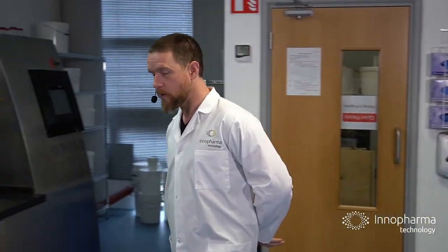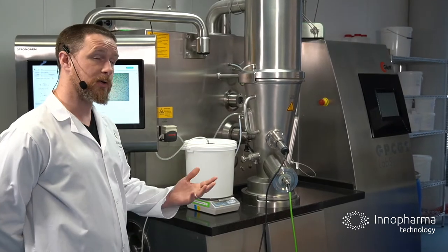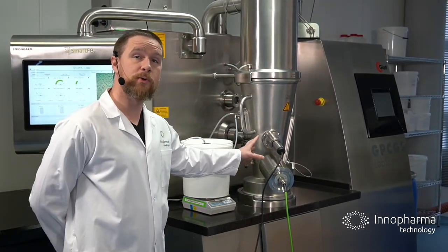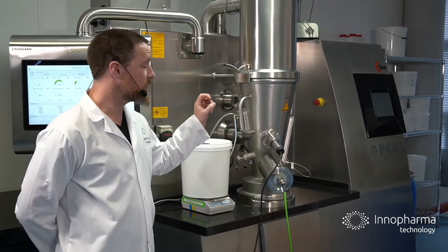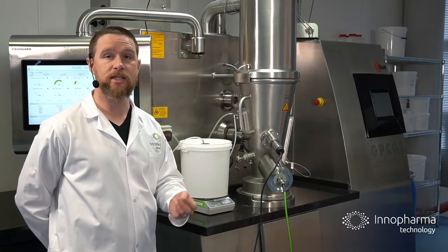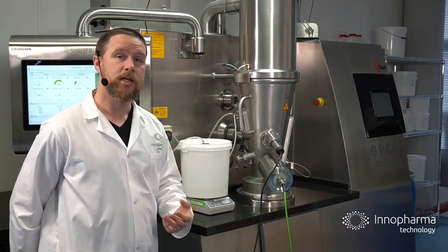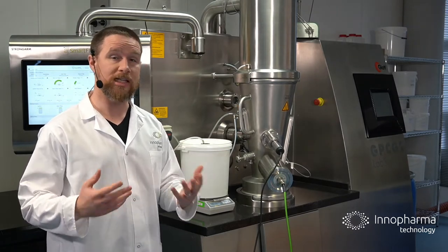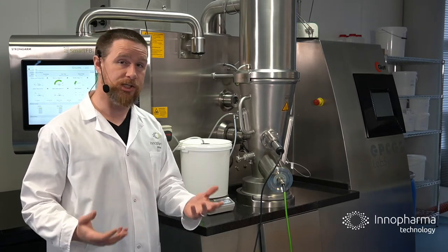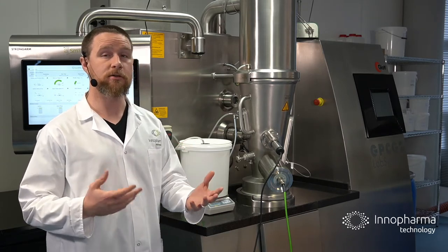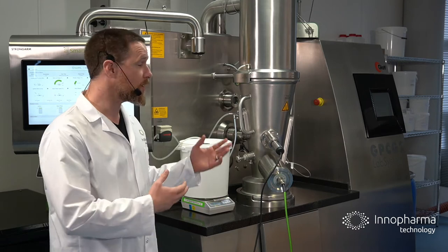If we go over here, we can see an in-line application of the ICON2. The same system can follow you along the journey. Here it is attached to a fluid bed granulator and it's measuring in the process, giving you insight into what's happening to your particle size. It's measuring critical quality attributes such as particle size and shape and seeing what effect the critical process parameters are having on that particle size.